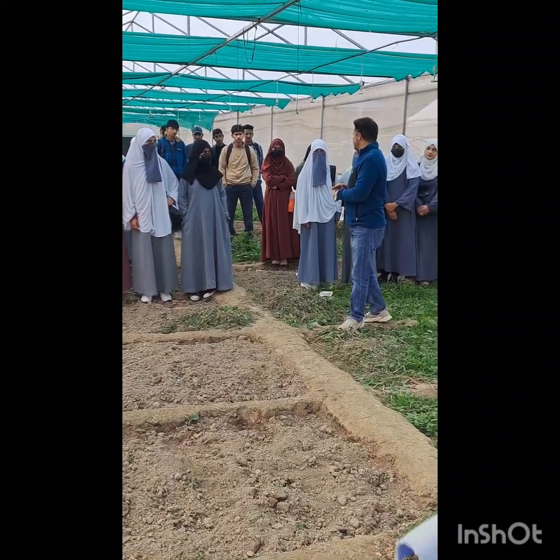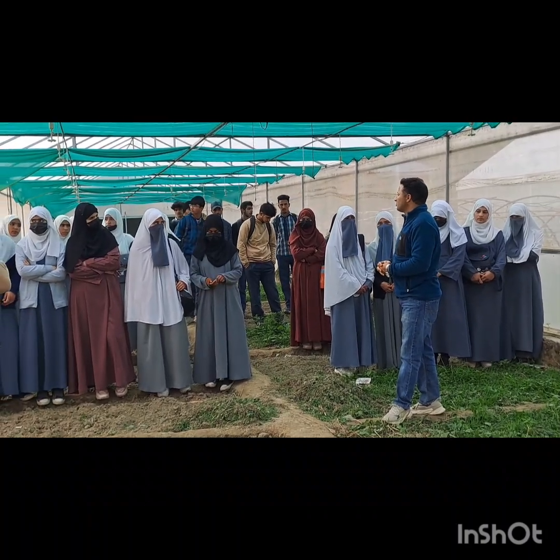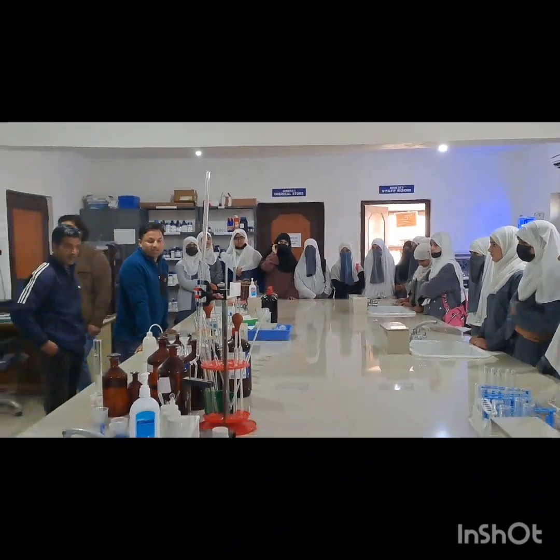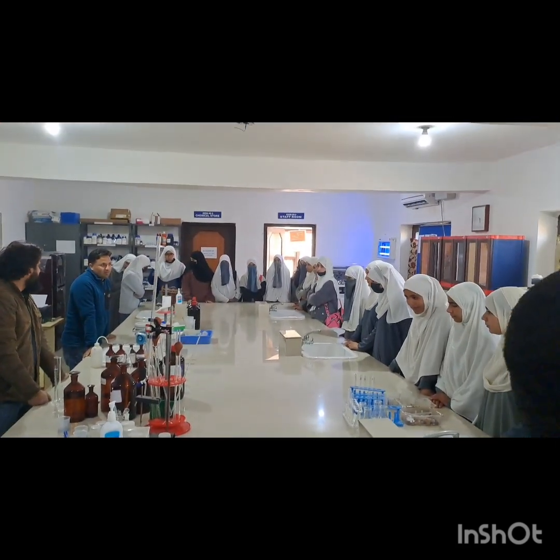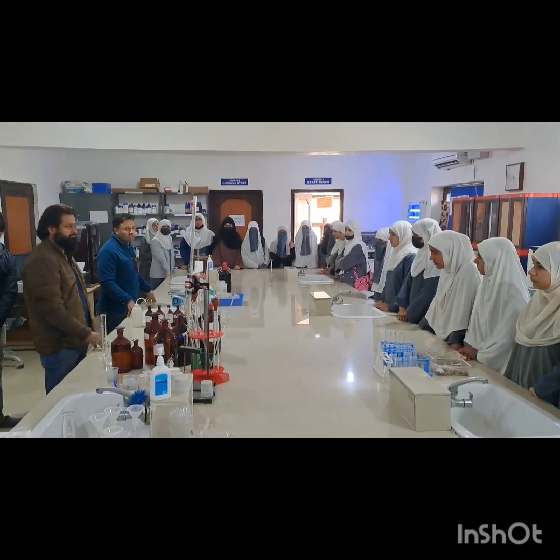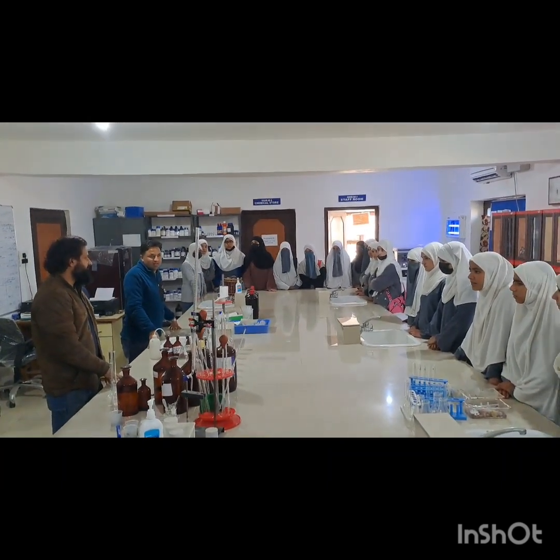Dr. Inam, the head of the soil testing laboratory, warmly welcomed the students and began the tour by introducing the facility. The STL in Bandipora specializes in testing soil samples from various regions to determine their physical, chemical, and biological properties. The lab helps local farmers by providing them with soil health reports and recommendations for fertilizer application and crop selection. 4. Key activities during the visit.